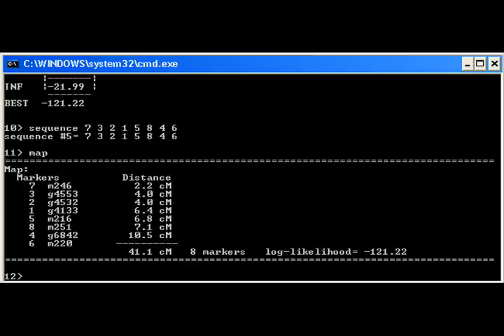Finally the map command outputs the linkage map defined by the sequence from the previous command. The way to read the map is that the distance between locus M246 and G4553 is 2.2 centimorgan. The total map distance is 41.1 centimorgan.